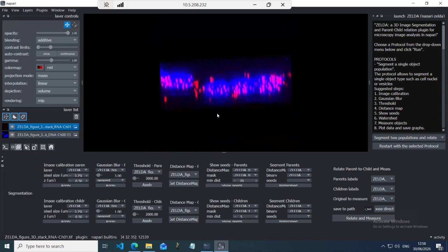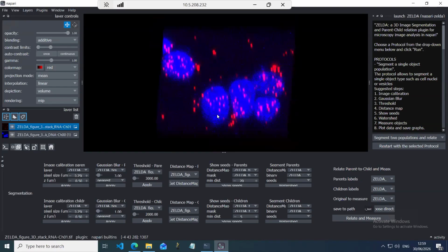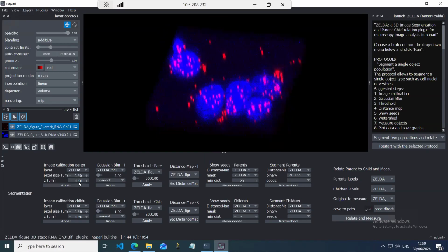recentered around our data. So as you may notice, this is still not a very nicely elongated 3D dataset, but we have a way inside the software to change the calibration. That is very important because in the end, we want to have results represented in units of microns rather than in units of pixels. Once I've done this, I can take the first layer, nuclei, and I'll try to segment them.